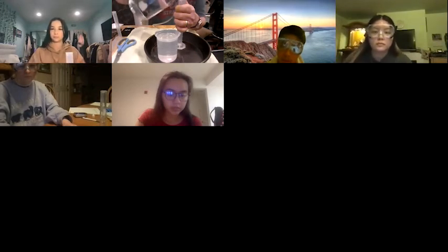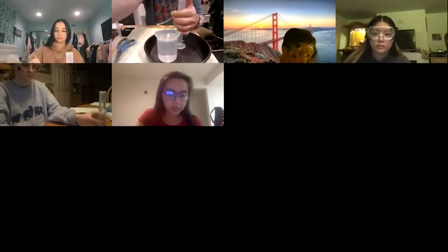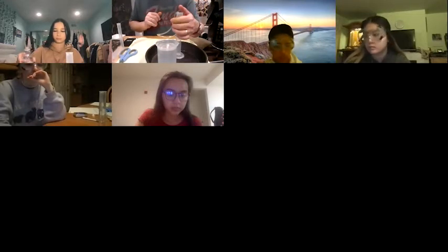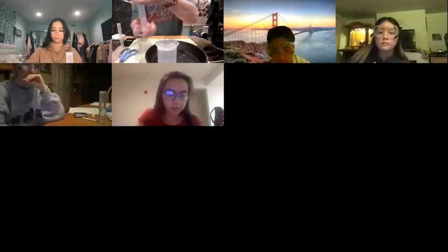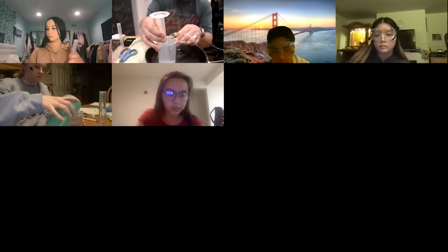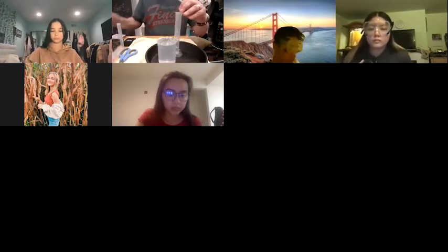So basically just fill up the 50 mil graduated cylinder, basically till it's overflowing. You see, I've got it filled up to the very top and then some. Put my thumb over it and then try and quickly turn it upside down and put it underneath the water. Not going to be easy to do. Oh man, I did a particularly poor job there. I had about 10 mils of gas left over. I'm going to try that again.